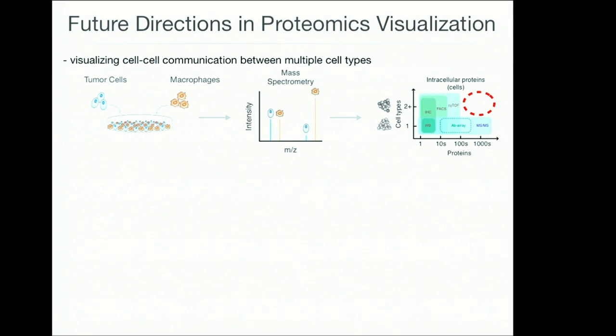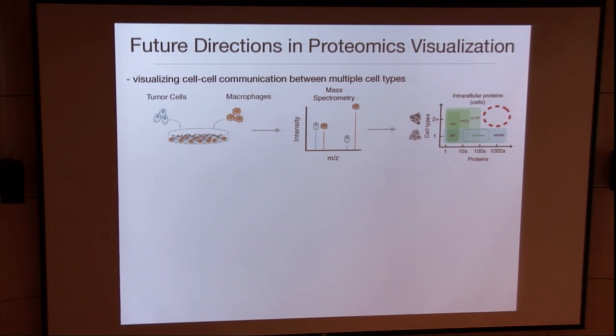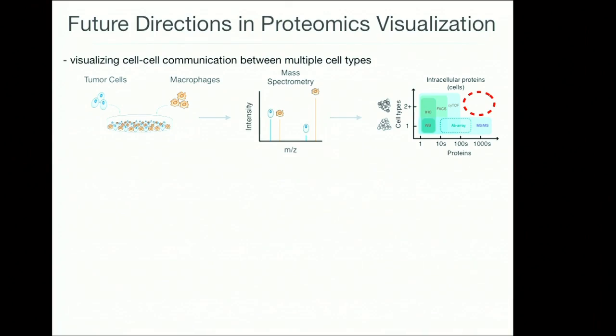This is extremely important if you want to track the cell of origin of proteins, and also if you want to investigate how, for instance, stroma cells like macrophages influence tumor cells and how they influence drug resistance responses. So really, we think we have a new cool method where we address a need of being able to use high throughput techniques to identify the cell of origin of proteins.